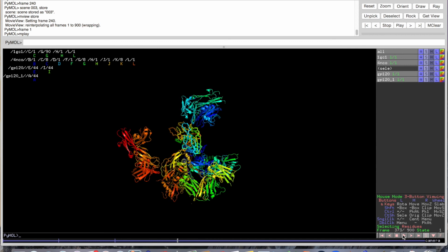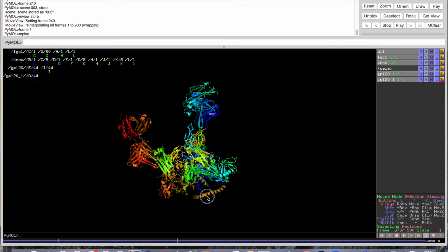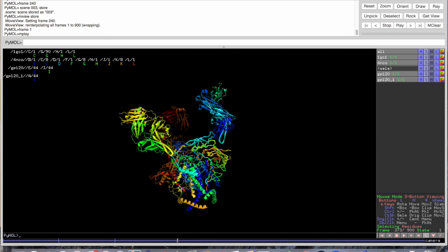Now, if you accidentally do this out of order, you're going to see the camera angle change, but it won't become a cartoon, or vice versa. It'll become a cartoon, and the camera angle won't change, or the whole thing will be a cartoon through your entire movie, and then I don't know. It's just a disaster. So, just do it slowly, do it carefully. It takes a long time, but you get the idea. Okay, so that's the gist of it.